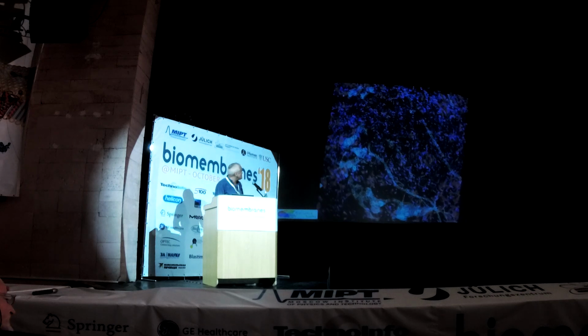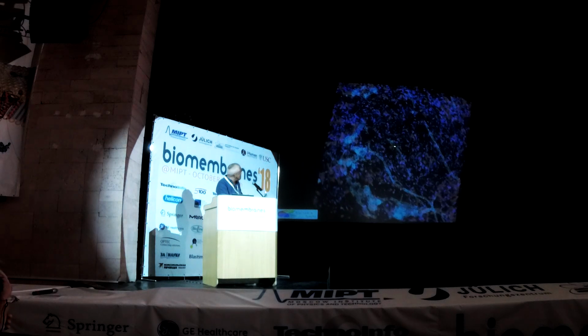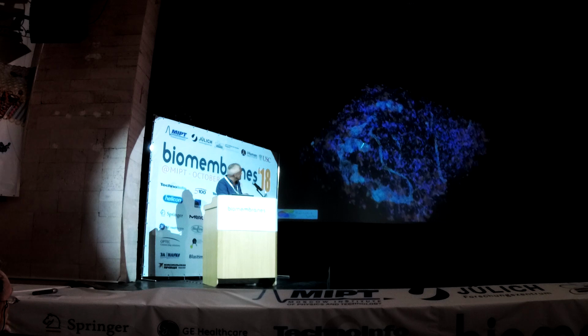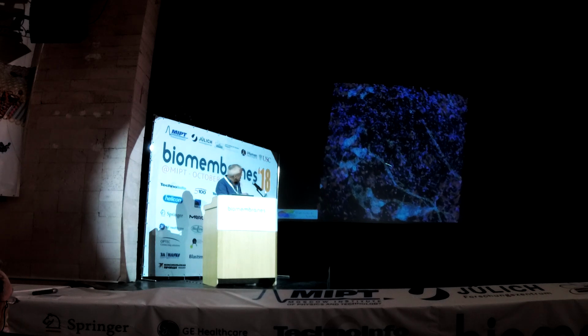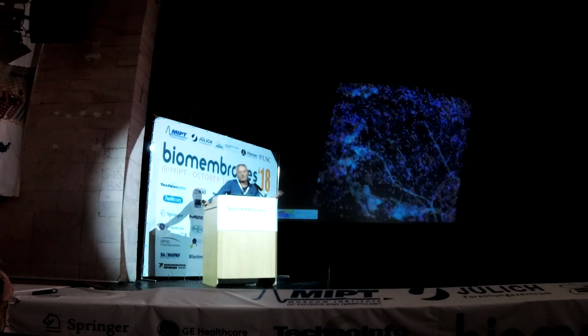So we are able now to distinguish different synapses and code them depending on their size. In red are the bigger synapses, in blue are the smaller synapses, and these are the boutons we are interested, for example, in, and then we can see which synapses interact with these boutons, and depending on where you are in the brain, you will see that the active zones are larger or smaller, for example.